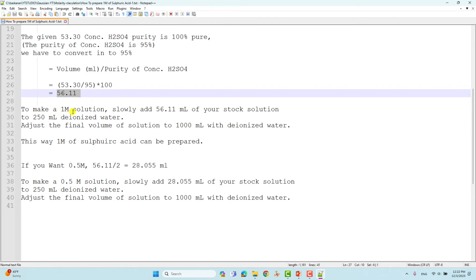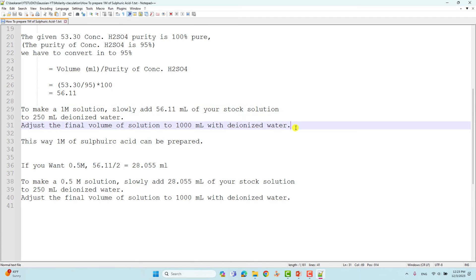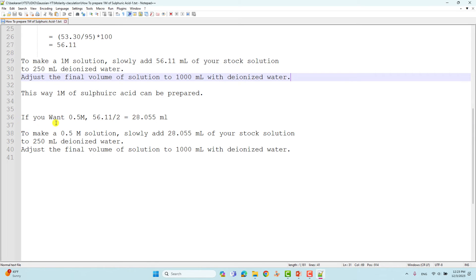To make a 1M solution, slowly add 56.11 mL of the concentrated sulfuric acid stock solution to 250 mL of deionized water. Finally, adjust the total volume to 1000 mL with deionized water. Always add acid slowly into water.